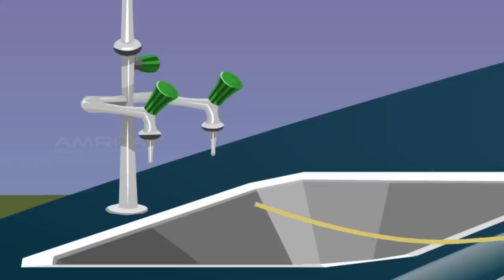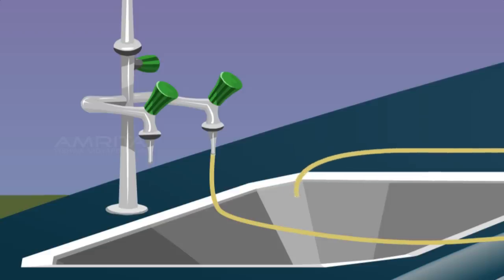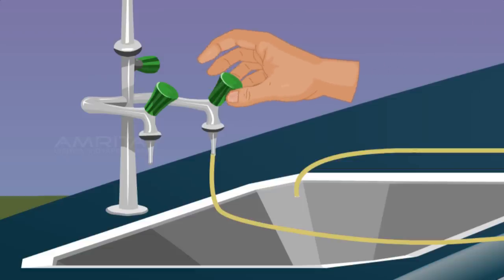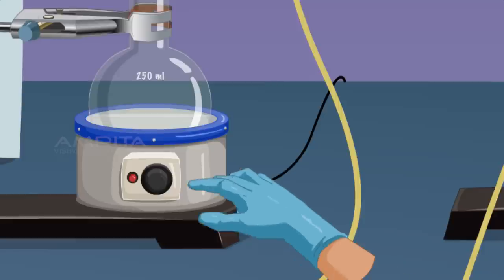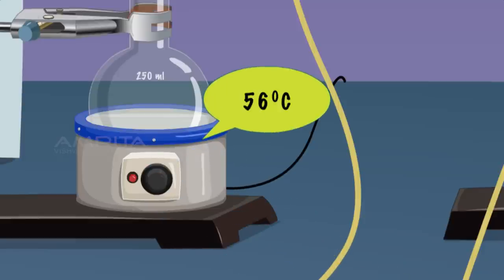Connect a rubber tube between the tap and the inlet of the condenser to allow cold water to enter. Connect another rubber tube to the outlet of the condenser to pour the hot water from the condenser to the sink. Open the tap so that water flows through the tube and fills the condenser and then comes out through the outlet. Set the temperature of the heating mantle to 56 degrees and heat the mixture to boil.